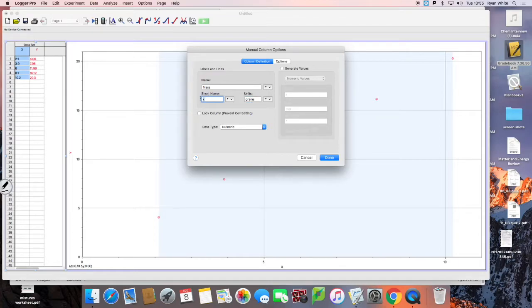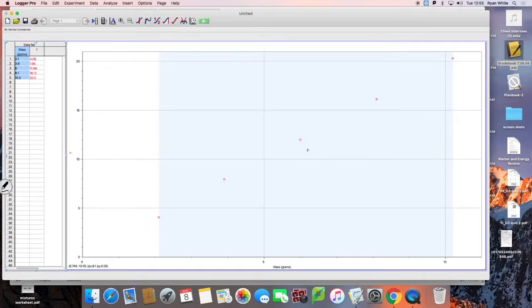Short name is mass — that's fine. Then you hit done and you can see that you've got the mass label.